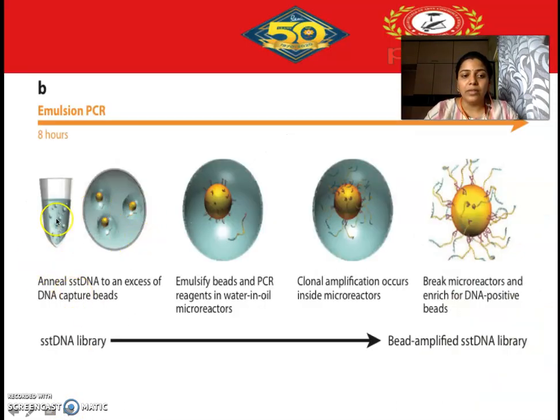Here you can see how the droplets form. You can see the oil droplets, and this mixture would be rigorously shaken so that these droplets form, and inside each droplet you can find a bead with one template. Once the cloning and amplification take place, the same strands or templates will get added to the probes which are present. These are nothing but the primers present on the streptavidin coated beads.